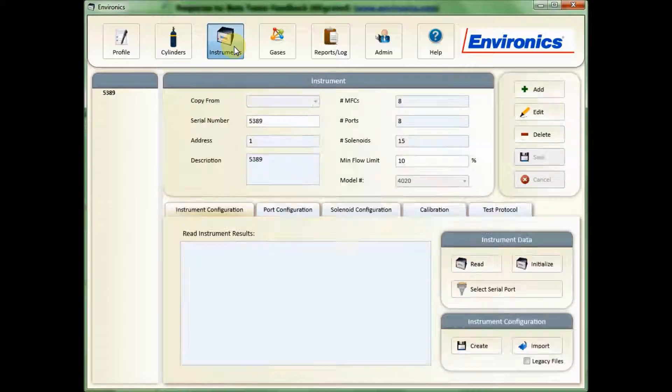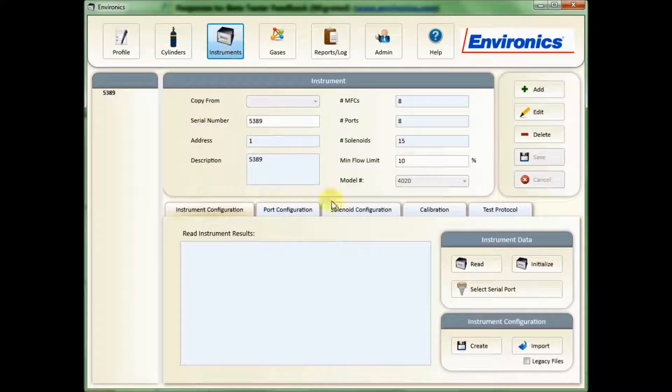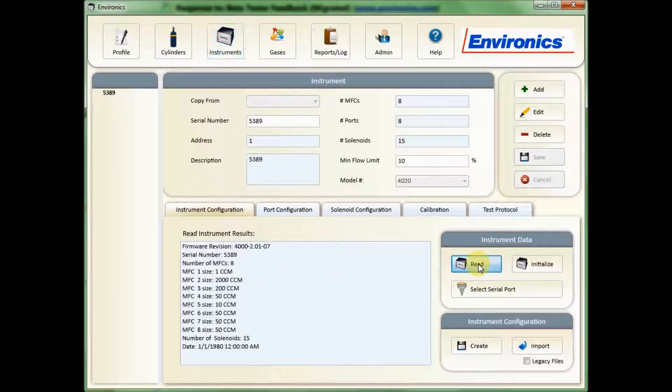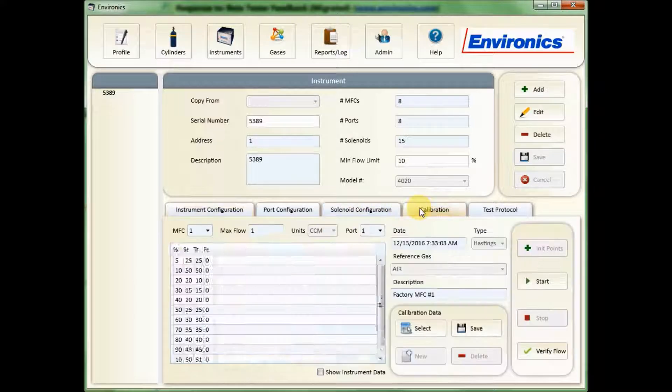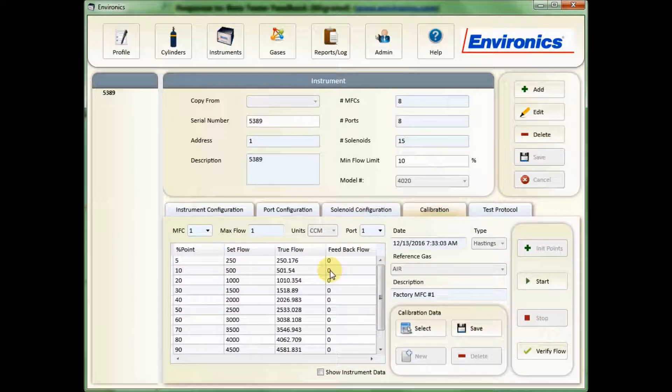The first is to import your instrument data. You can see we have done that here, and we can read that instrument as well. You can see that data has been inserted.